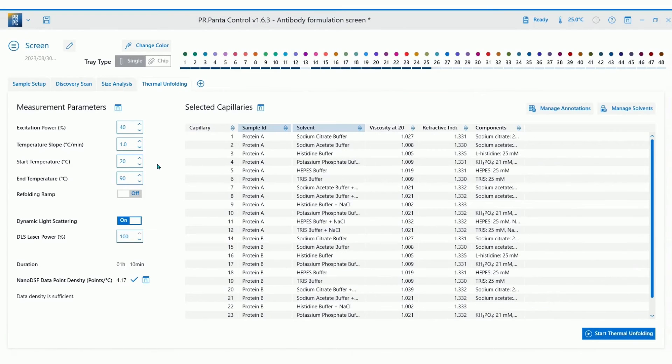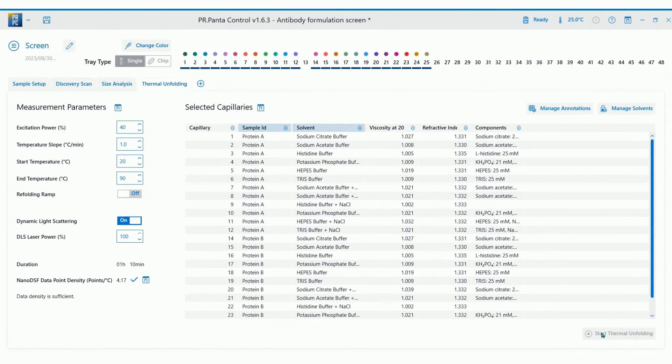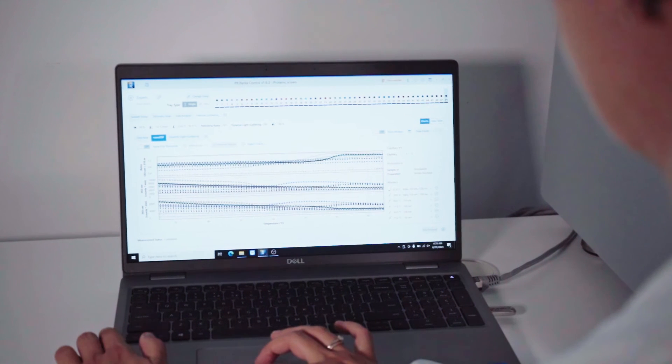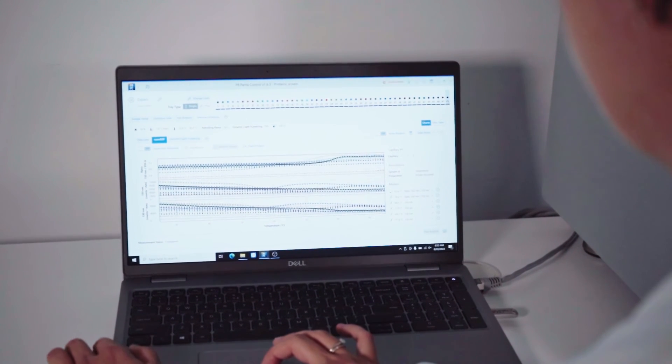Once you're set up, click start measurement. And then you can simply walk away. There is no need for you to stay at the instrument unless you want to watch the results populate in real time, of course.